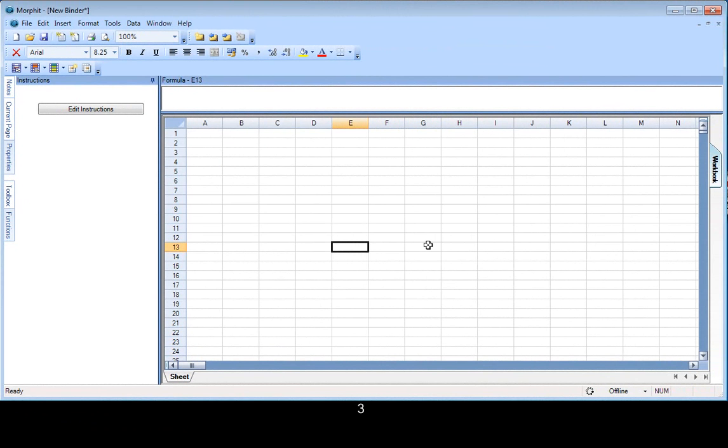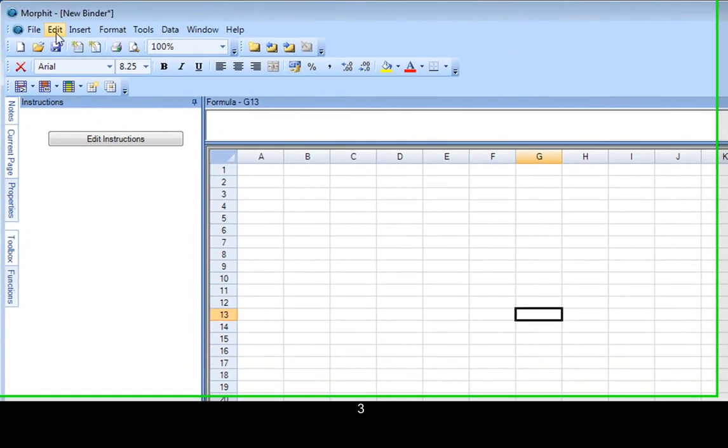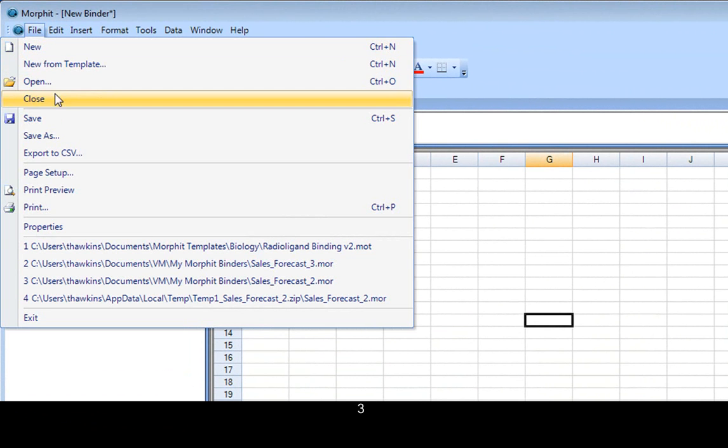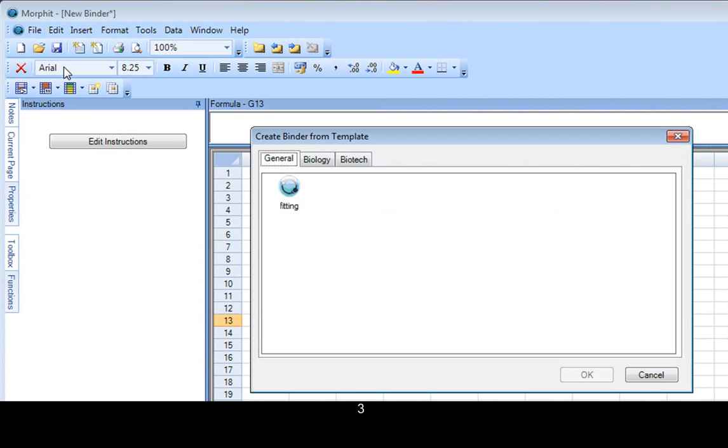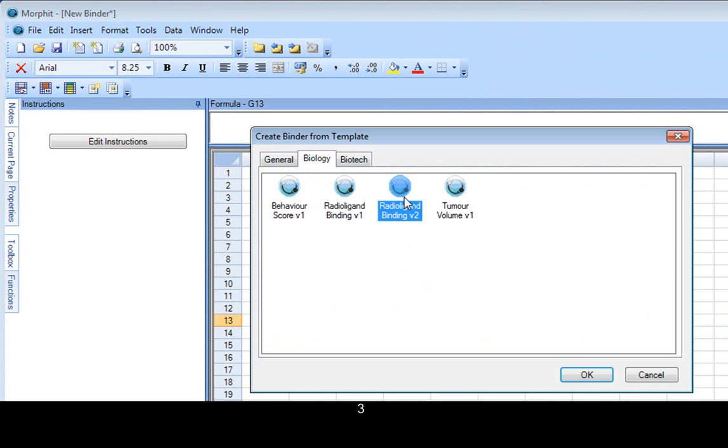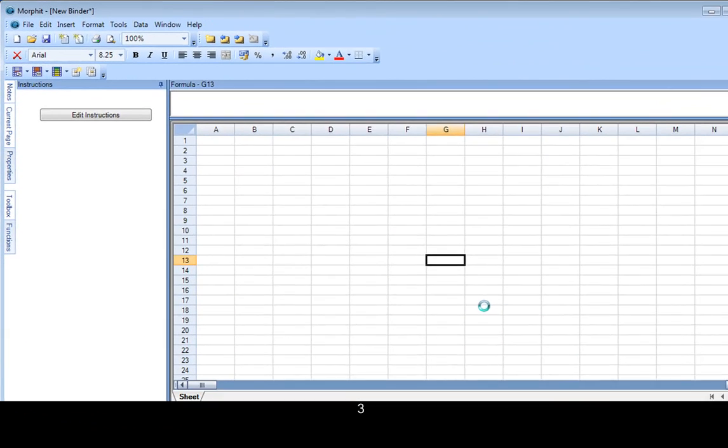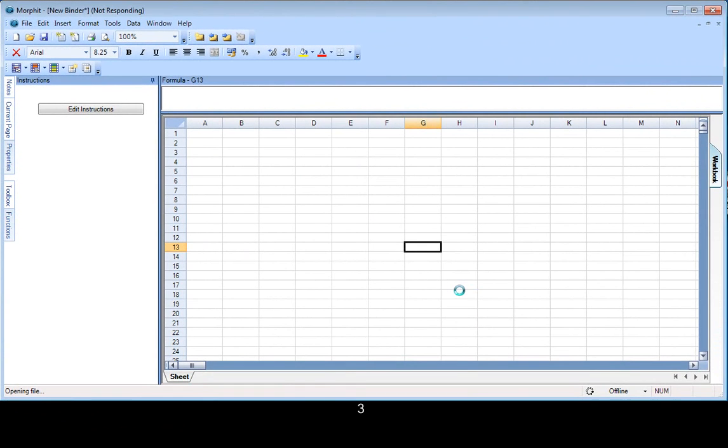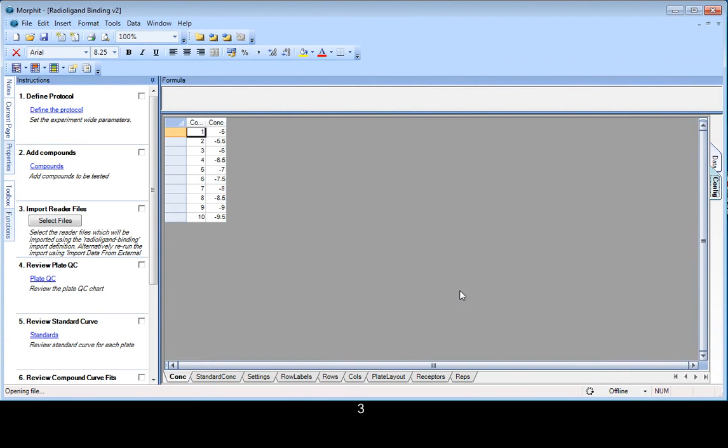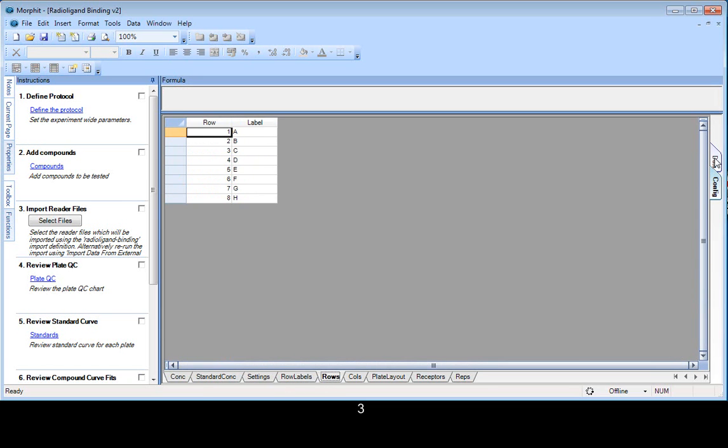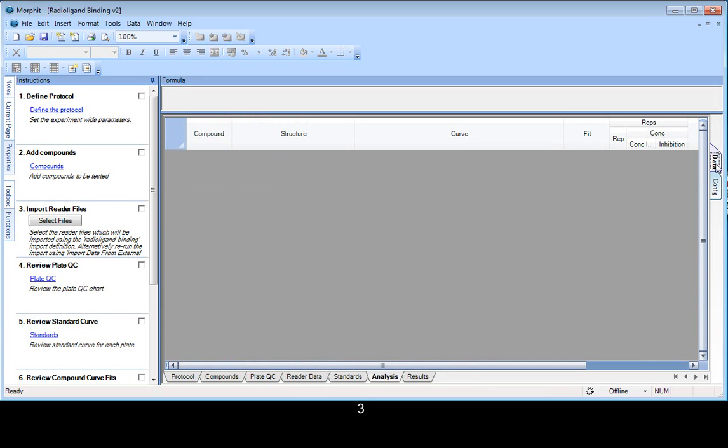So we've opened Morphit, and the first thing to do is to create a new binder from a template, the Radioligand Binding Template. Okay, so the template is opened. We see the usual collection of pages within the workbooks, and we've opened with the instructions panel showing, telling us how to run the experiment.